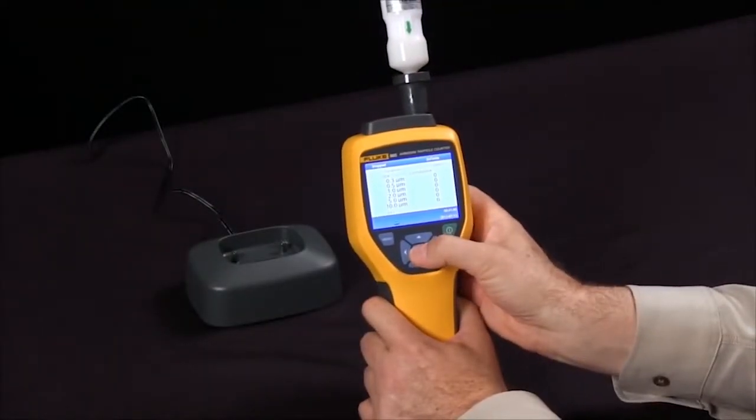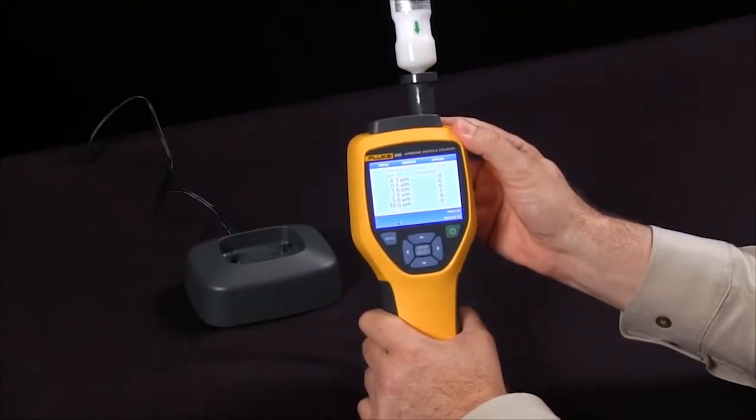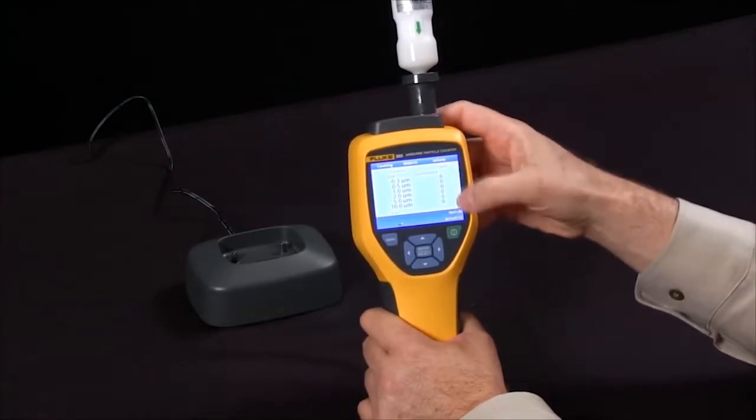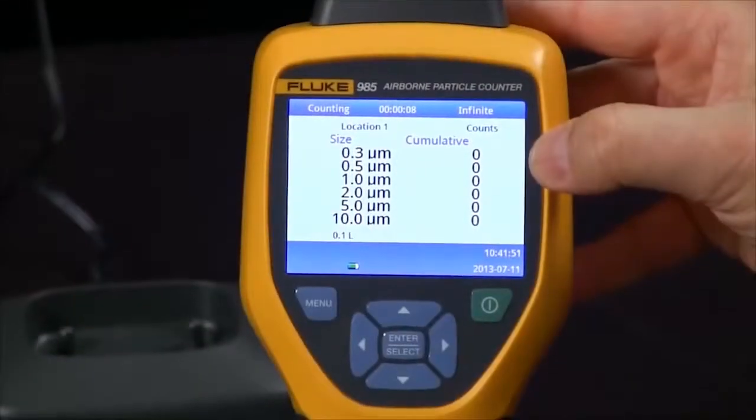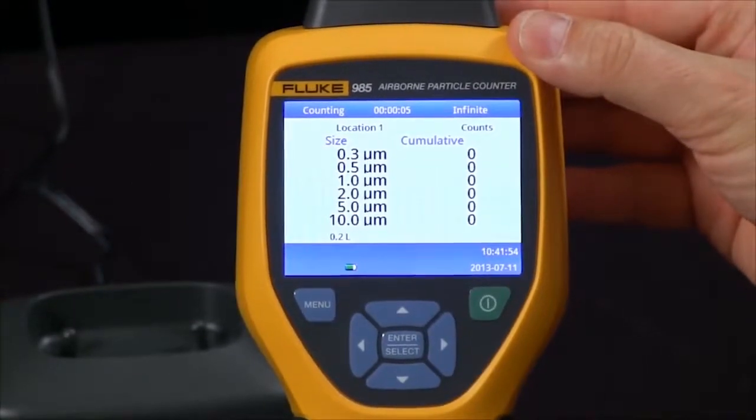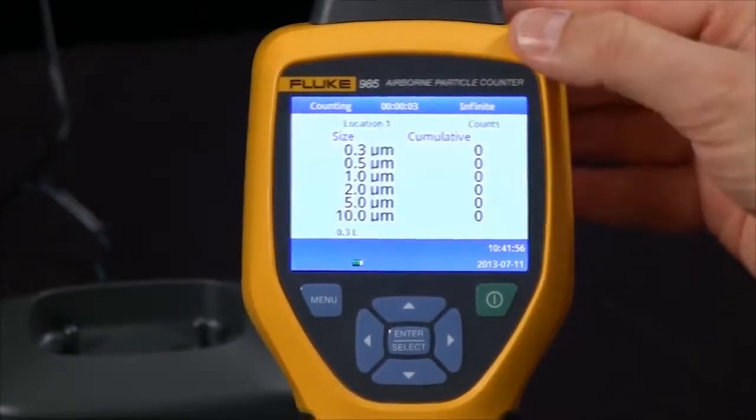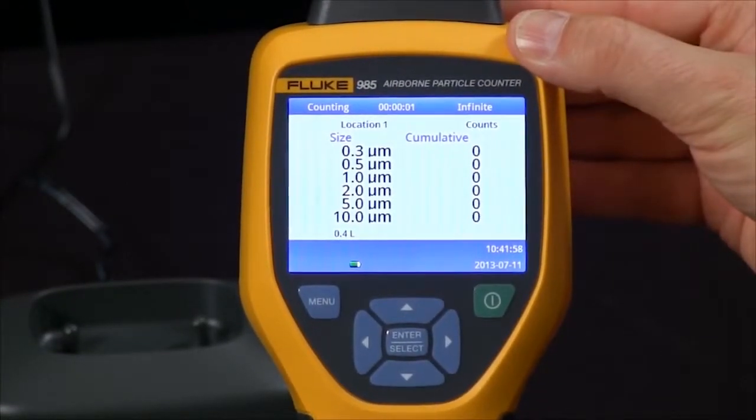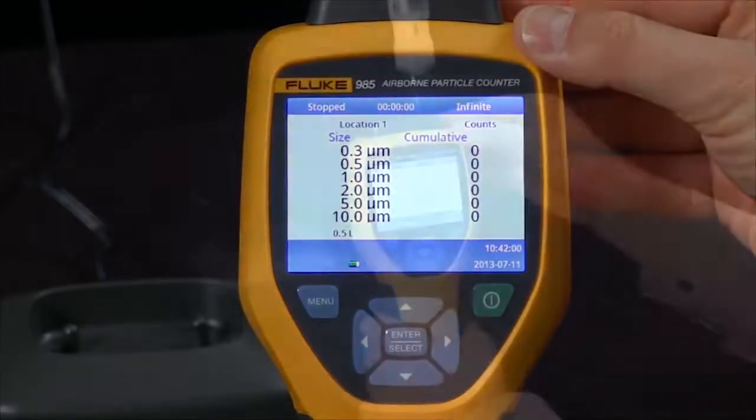Start your sample and if the filter is working properly we should see next to nothing coming through on the particulate counter. I've set this for a 10 second sample size. You can set your sample to be based on time or the volume of air that is passing through the adapter.